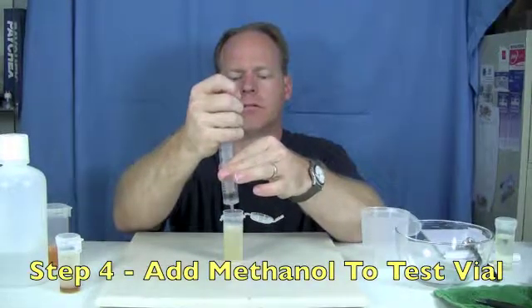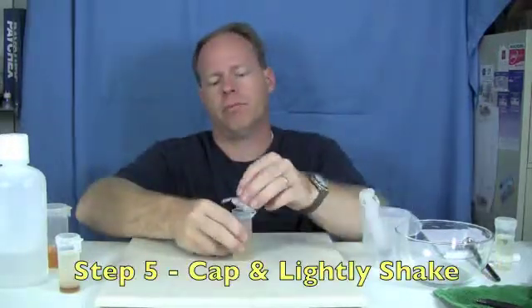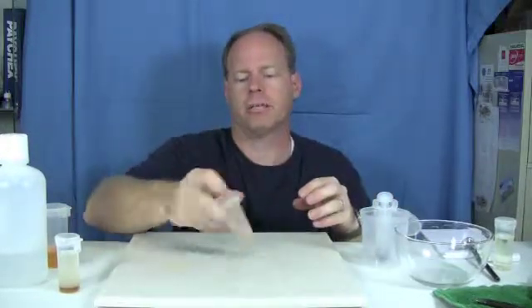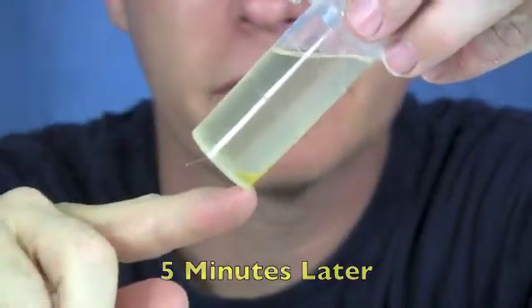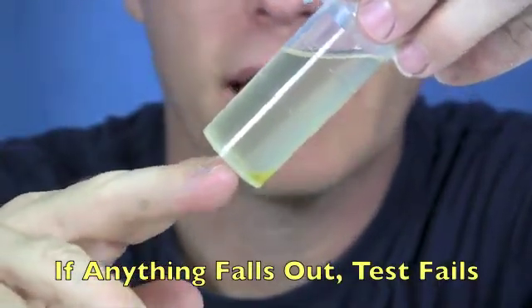Cap it, and we just turn it a couple times and let it sit here for a minute. See that little tiny sliver of fuel falling out? That's indicating that we didn't get a good reaction in this batch.